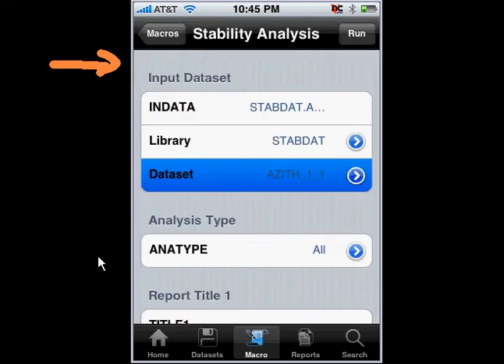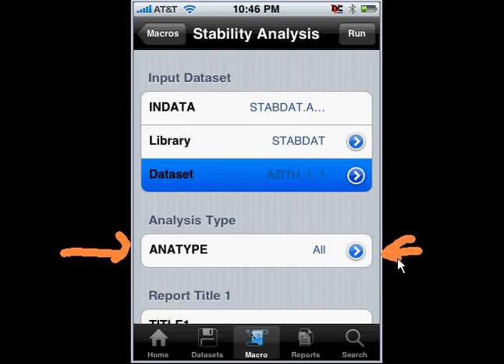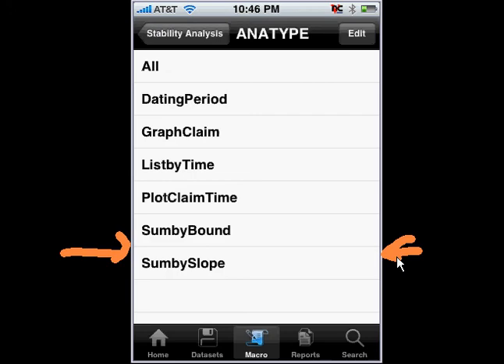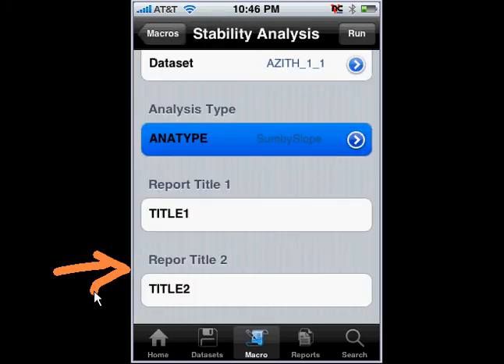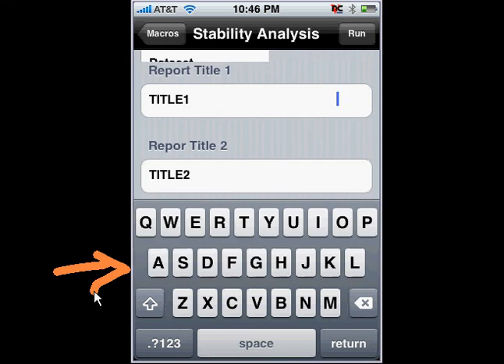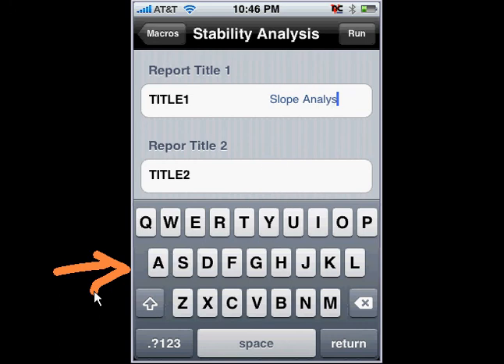Then you have the option of selecting all the different types of analyses, which we did on the first example. For example, if I wanted to, I can change this and select just one analysis — for example, the sum by slope. In that case, I can actually change the title if I wanted to specify that this is the slope analysis that I wanted to run, so I'll go ahead and type with my fingers here.